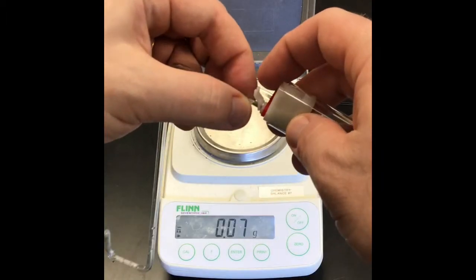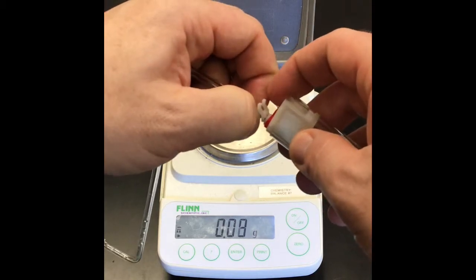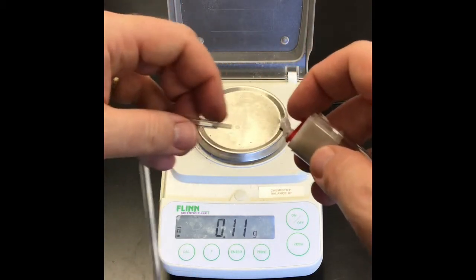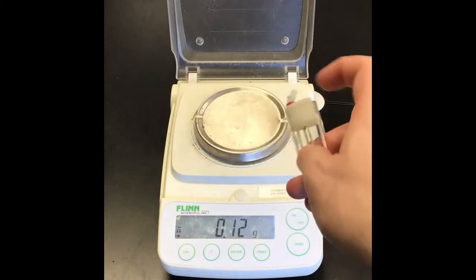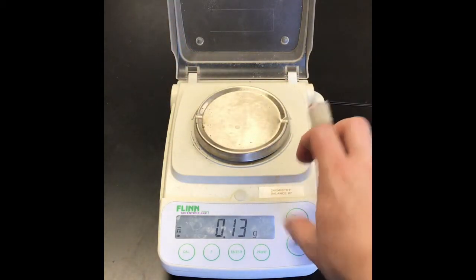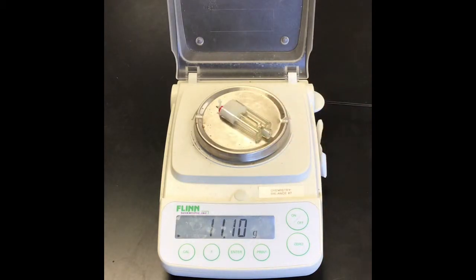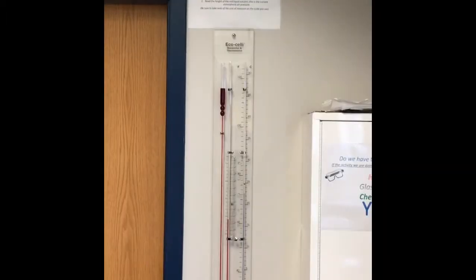Then you want to carefully disconnect the butane source from that rubber adapter. All right. And then you want to take that and put it onto the balance and record the new mass. And the difference between those two masses will tell you how much butane gas was dispensed.